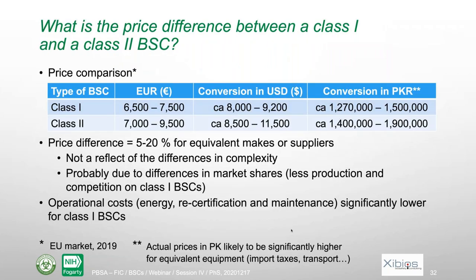What is the price difference between class 1 and class 2 biosafety cabinet? I think I will disappoint you on this. First, I don't know the current prices in Pakistan, so I looked at the current prices in Europe, and that's from last year. And you see that for a class 1 and a class 2, the difference is not so big, and there is an overlap.